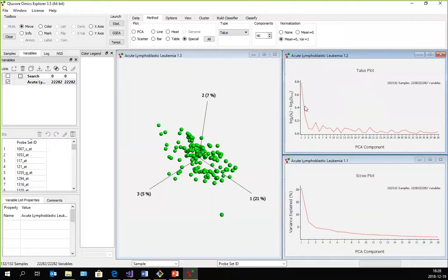That's a little bit about some of the new plots. And while we're at it here, these are 2D plots. And what we've also added here is the ability to select the axis and bring up the settings here.